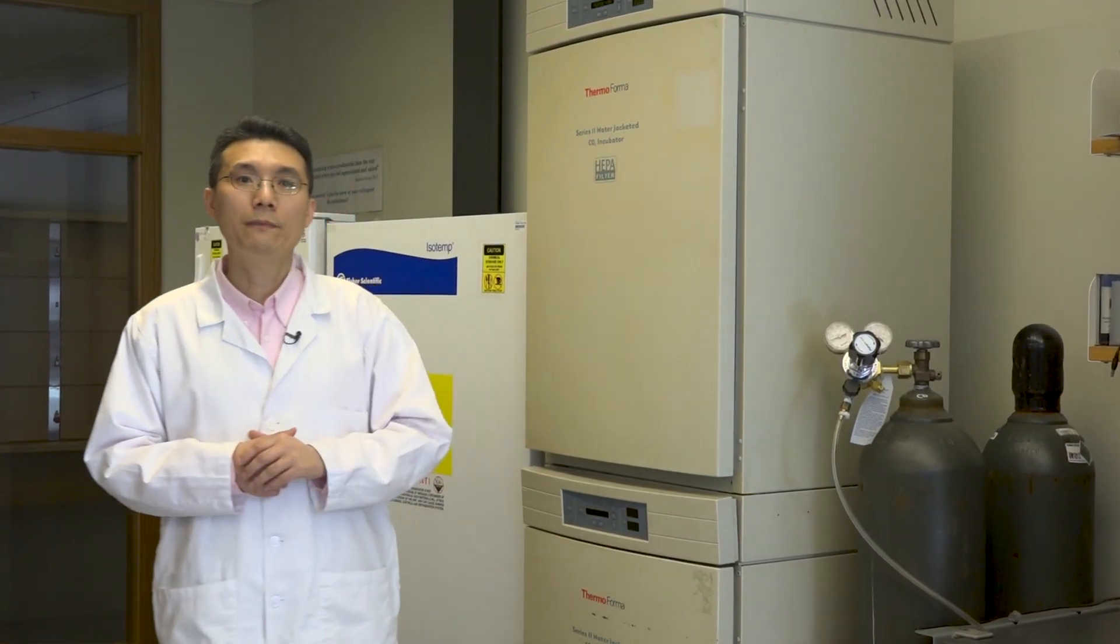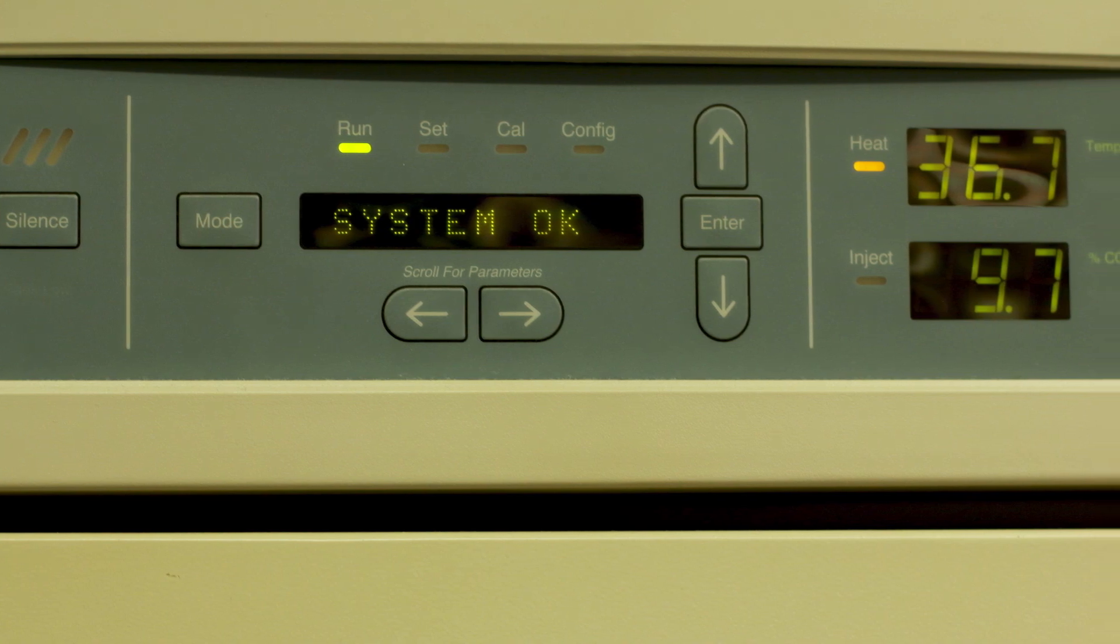We usually grow cells in 37 degree carbon dioxide incubators like this to maintain optimal temperature, moisture, and pH for the cells.